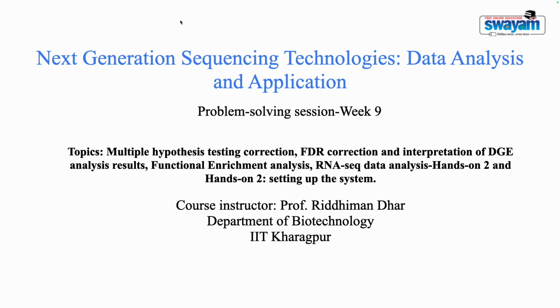Okay, so good evening all. So we'll start with our problem solving session for week 9. The topics that we will be covering today are multiple hypothesis testing correction, FDR correction and interpretation of DGE analysis result, functional enrichment analysis, RNA-seq data analysis hands-on 2 and hands-on 2 setting up the system.